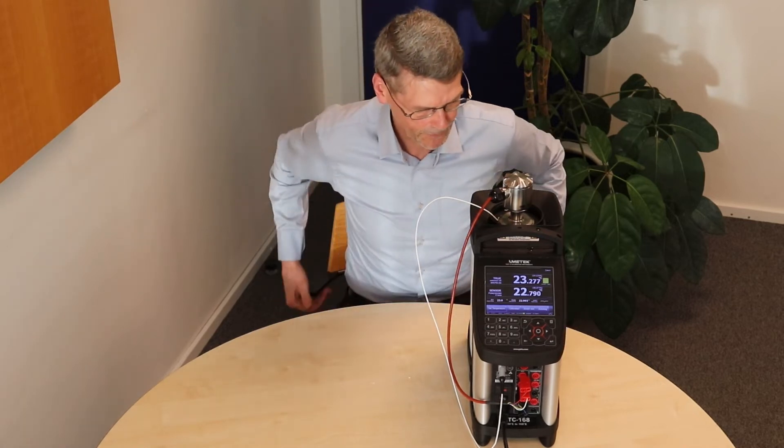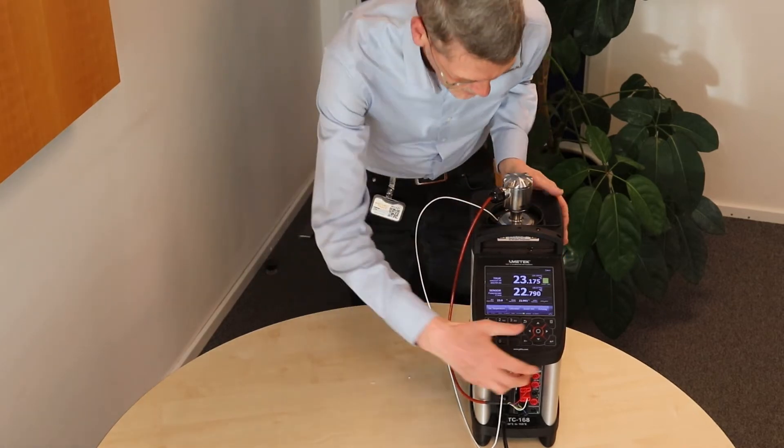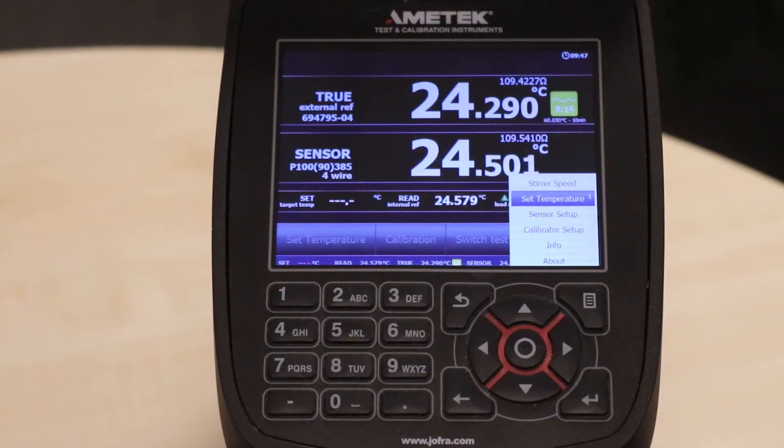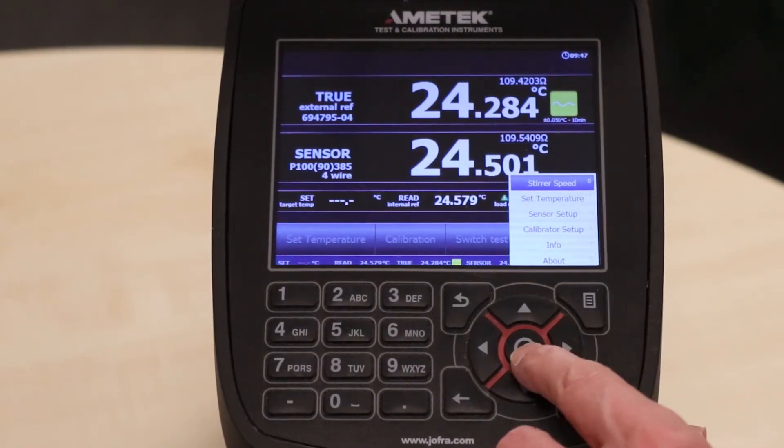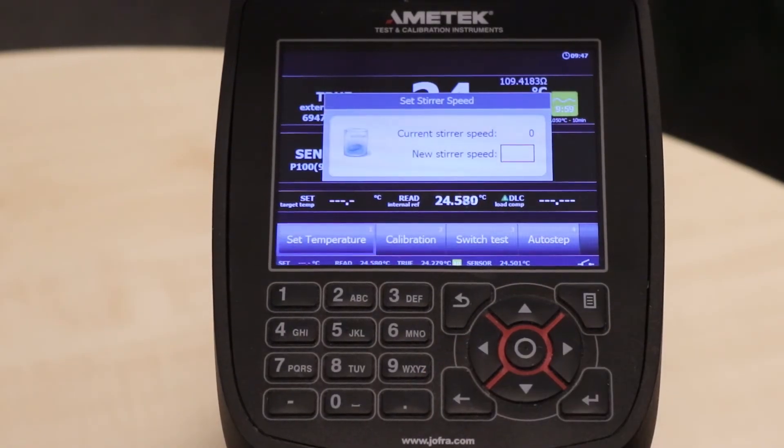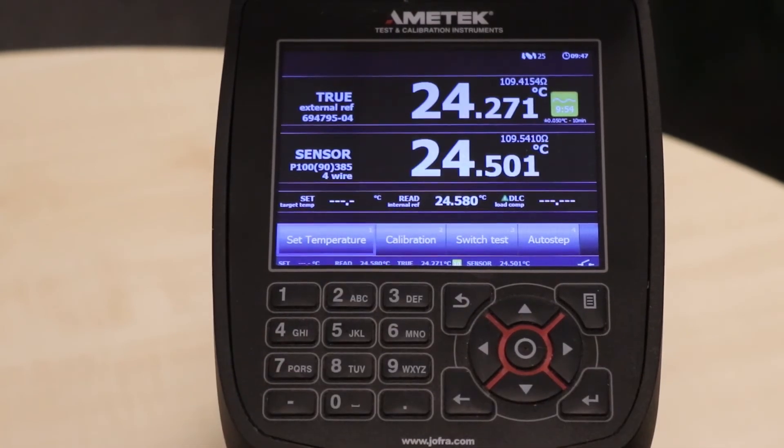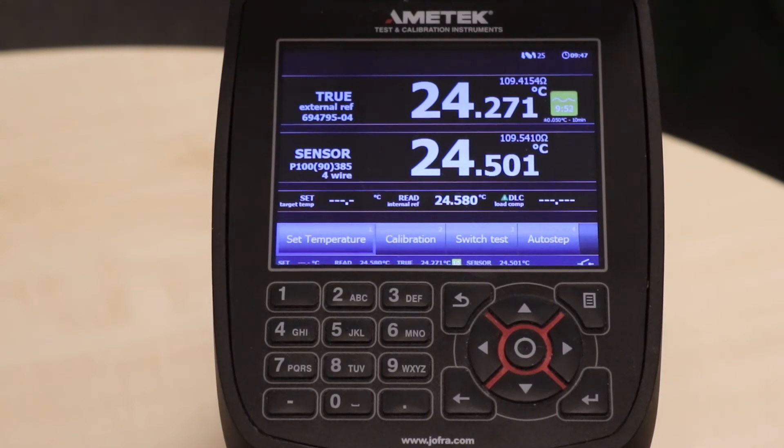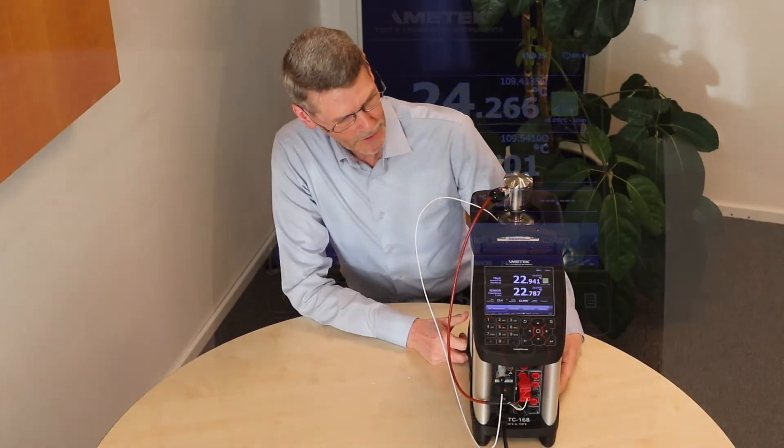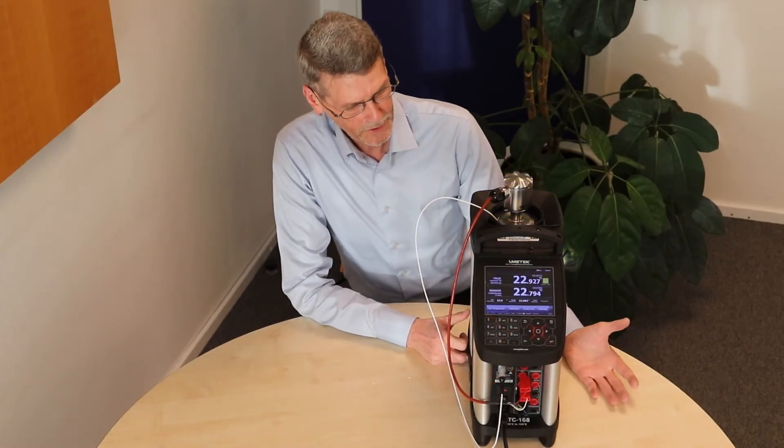Now we need to set the steerer speed. We go into the menu, go into the steerer setup, and we set it to 25. You can now hear that the steerer is running. The setup is ready, and we can now set a temperature.